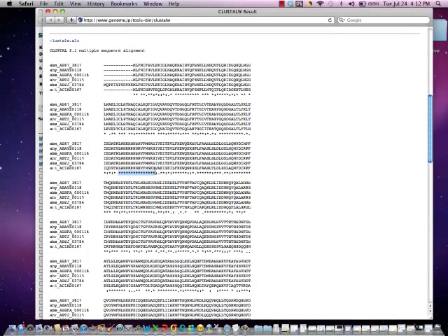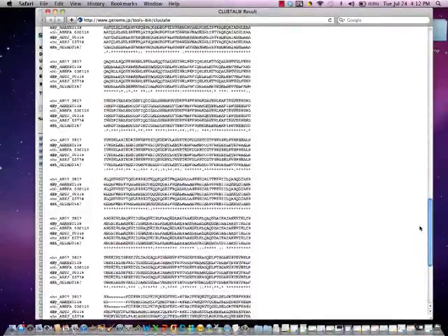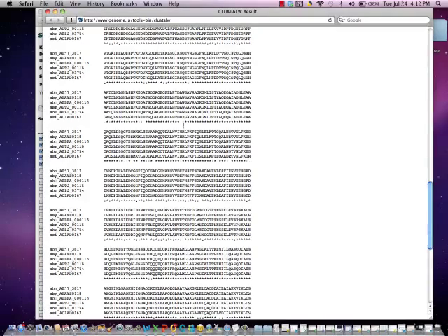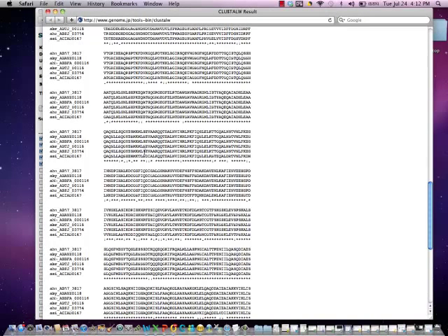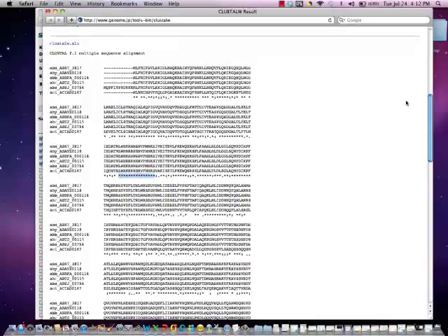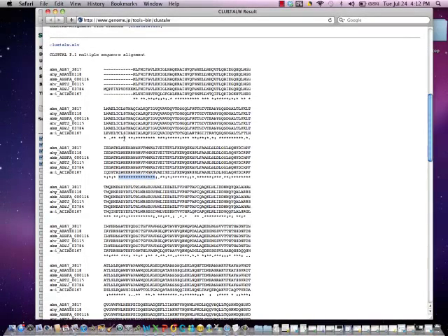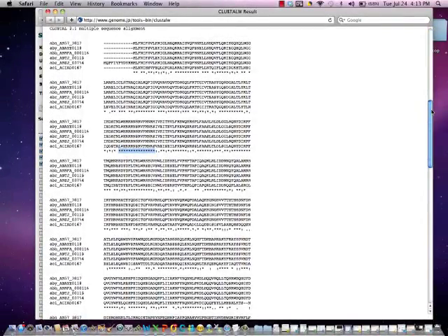And so when you look at all these proteins, you can tell that there are really some regions of these proteins that are absolutely conserved. Okay? And then there are some other places where there's a lot less conservation, which means you see spaces in the alignment where there's an A or a D here, an A or an N, an L or an A, T or an M, and so on. But actually these proteins are so similar that it's hard for me to find a region of the protein that is less similar to these other proteins. So it's a pretty strong alignment, strongly suggesting that these proteins are evolutionarily descended from the same common ancestor and that they are very likely to have a similar function.